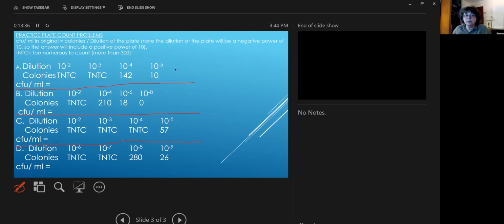So in other words, a number times 10 to the something. I don't care if your first number, the coefficient, is over 10, that's okay with me, but it should be in the general form of scientific notation. Something times 10 to the something CFUs per milliliter.